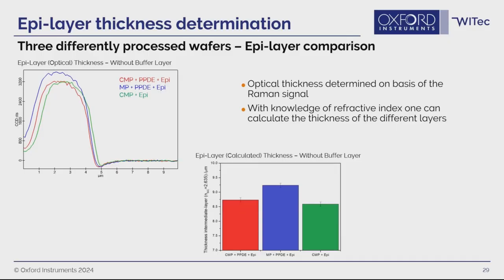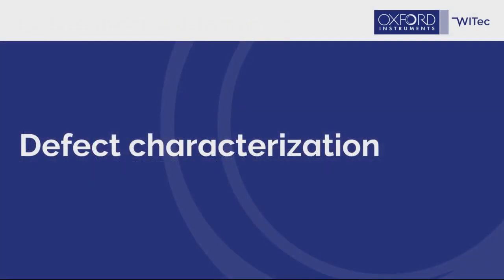The advantage of this method is, of course, that you can measure the thickness afterwards, and as Raman is a non-destructive method, you don't destroy your sample. So you can nicely see what was happening through your growing process, and in the aftermath you can nicely evaluate the results.